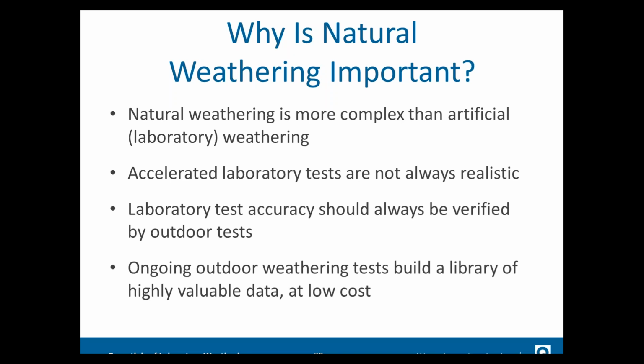And again, we mentioned it, outdoor weathering testing is not expensive, and that data is very, very valuable. The only problem with natural weathering is if you want 2 years of outdoor weathering, it's going to take 2 years. We can't do it any faster. So if you're thinking about starting a weathering program, start outdoors as soon as possible. That's the best thing that you can do.